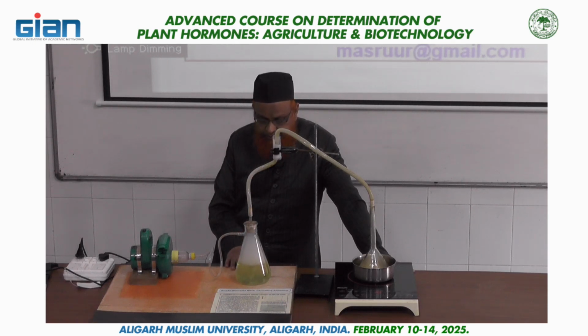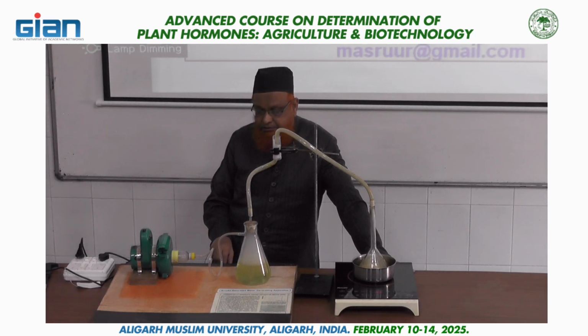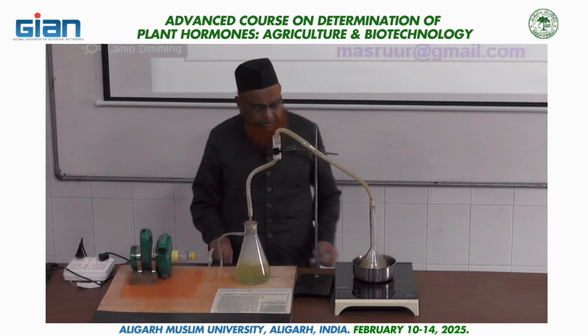On the other hand, you have to take a sample of this water, and also you have to perform the LCMS, okay, to find out how many fractions there are, and which fraction is KR1. If you are working on KR1, you can find the KR1 peak in your LCMS, right? Clear to you? Any question, any query, any objection?